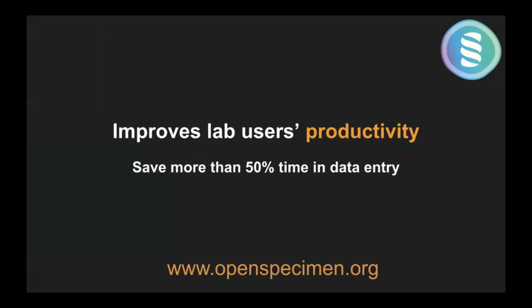One is for people who have been using OpenSpecimen for a long time. For them, it will bring in a huge improvement in terms of productivity. For example, we say it's 50%, but it should be more than 50%, because you're now able to do things in bulk. For example, a lab receives specimens across multiple patients.